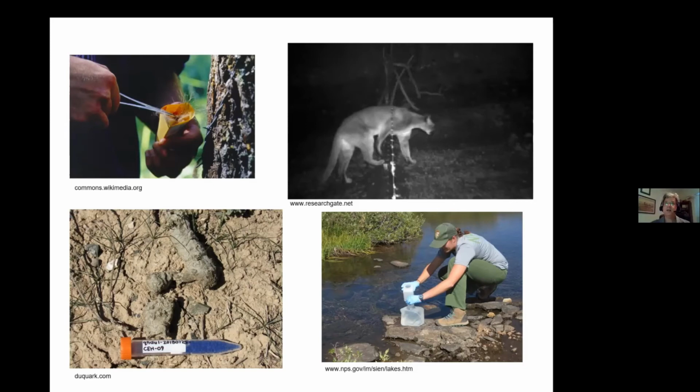All right, so if you think about it, there's a problem of scale. All right, so I put in this blank to remind me to talk about this. So, if you're going to get a hair sample off of one of those hair traps, there's probably some cells there, but it's not huge, right? So we're talking, like this much tissue.